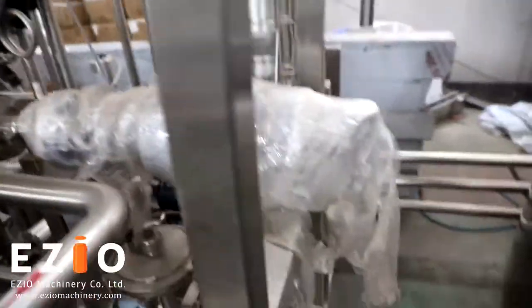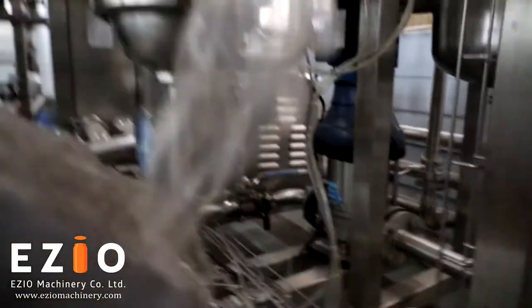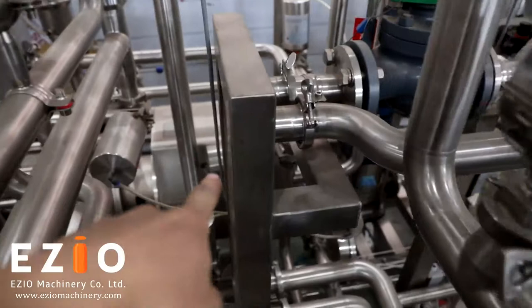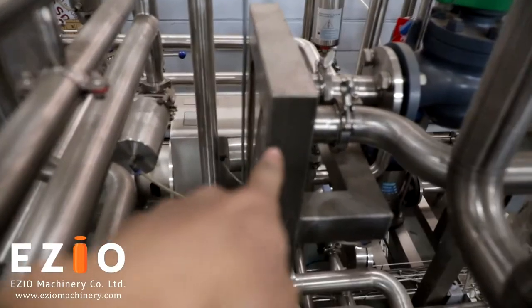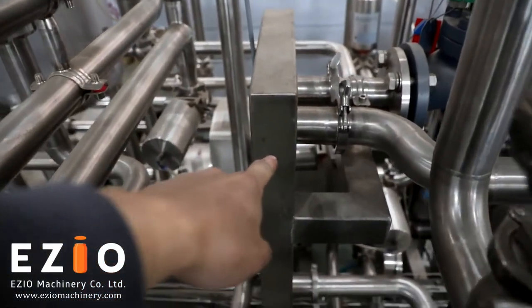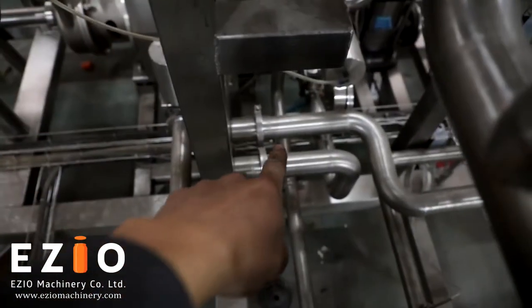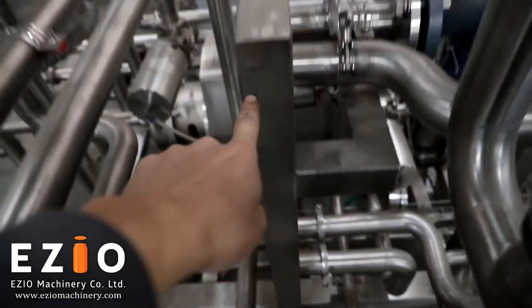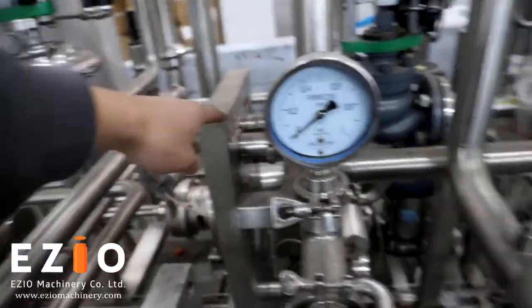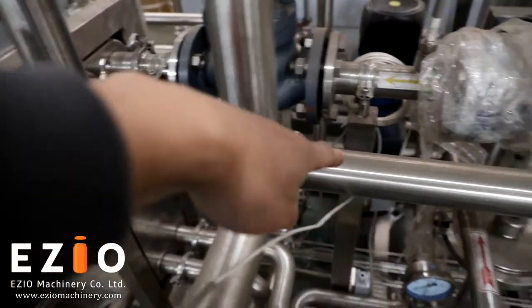The water goes down and comes through this pump, going to the heating area. The water will start heating from this point. Steam comes from here, and the water starts heating at this location. Then the water goes out through this pipe.